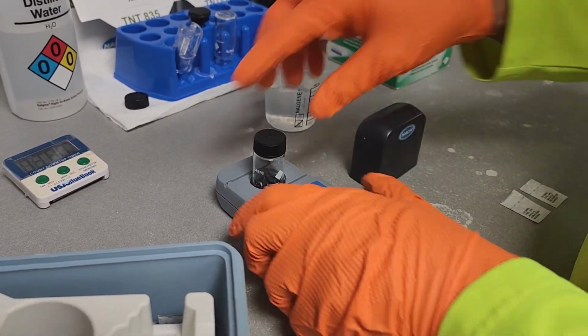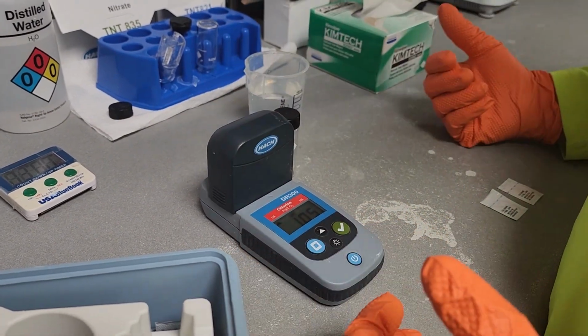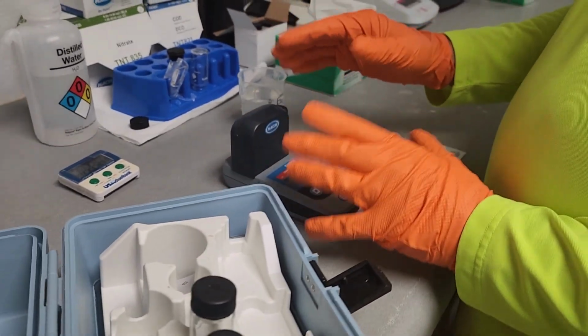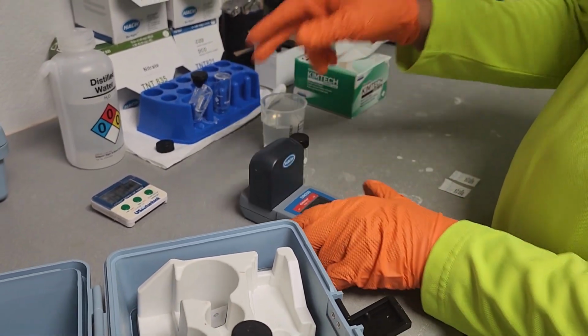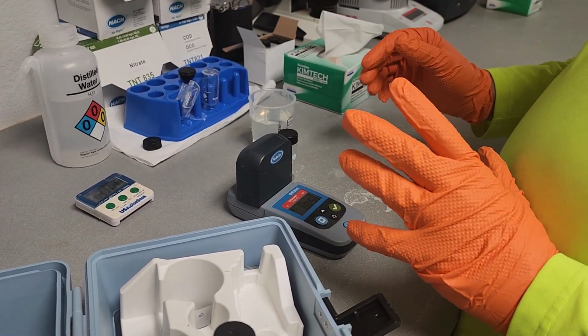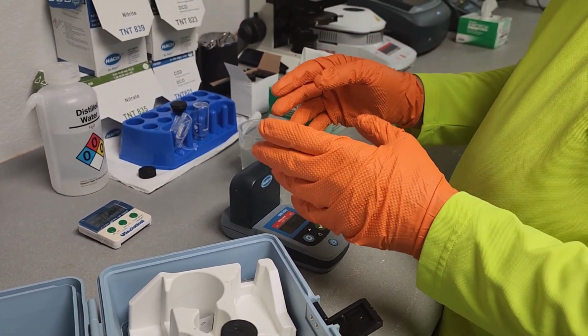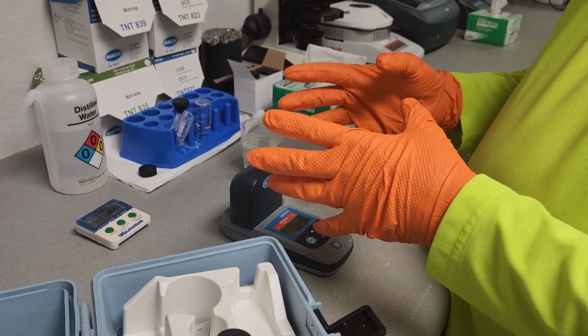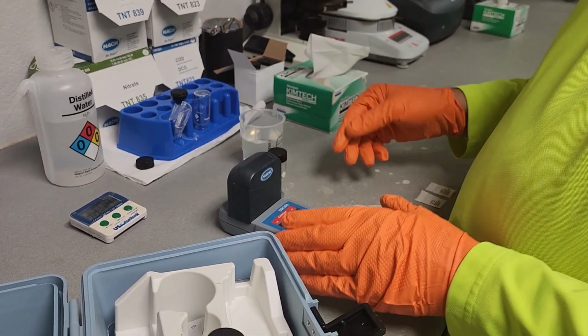Now because this sensor in here shoots a beam of light through here, you want to keep it closed. You want to keep that dark. You don't want to leave this meter out, especially if you're out in the field, out in the sunlight. You don't want to leave that exposed because the sunlight can stain or cause the light beam that goes through there not to work correctly.